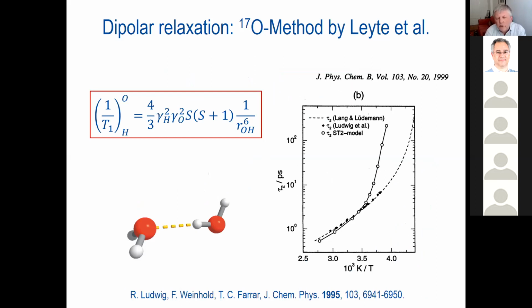But you see also in this equation here, we still had to assume that the coupling parameter here, the OH bond distance, is constant. And we see later on for other examples as well that in first approximation this assumption is justified. But this way then you are able to get the correlation times. Of course, that's a very expensive approach. And for the complex systems you are usually investigating, you cannot use this approach, right? For example, if you have nitrogen in your system, you could do similar experiments by varying for N14 or N15, but that's costly, and so it's related to blood, sweat, and tears. So it's really tough.